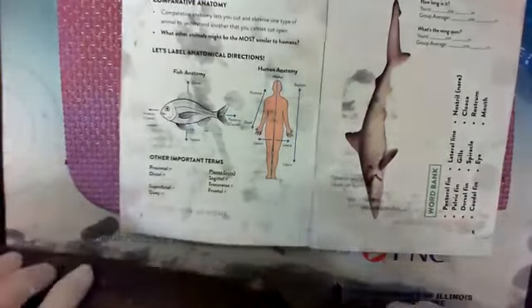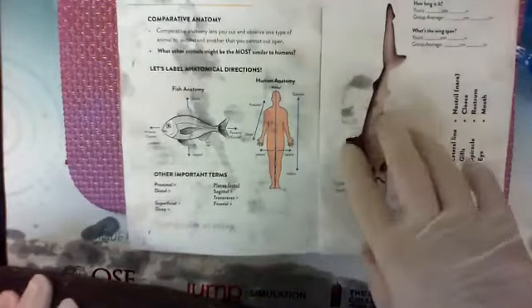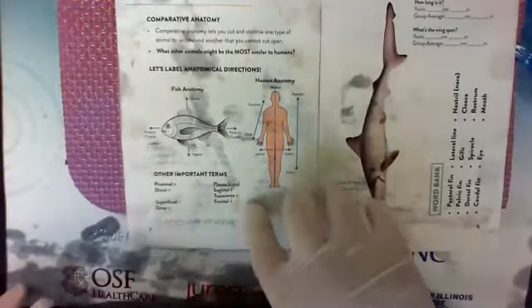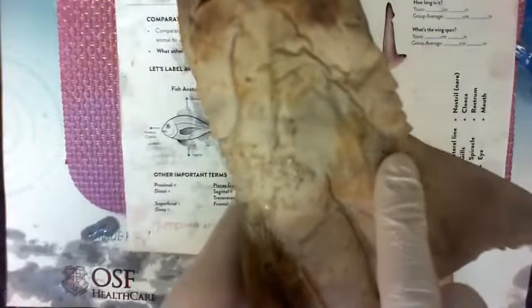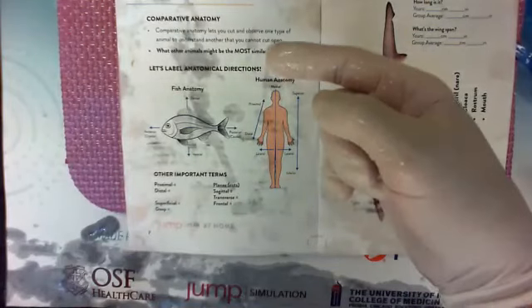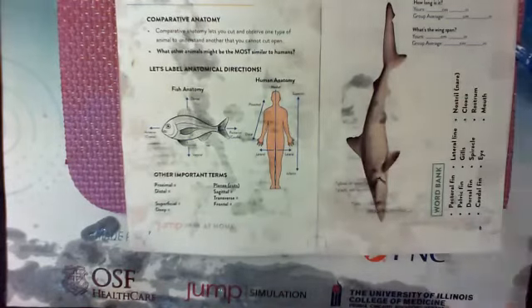Just comparing. And then these planes, a sagittal plane means you're cutting it right down the middle and separating left from right, which we'll do when we get into the belly. Where that folds at, we'll cut along that, and that's a sagittal cut. A transverse means across. Like you can see where these arrows go, those are in a transverse plane. So when we get into the chest, we'll actually make a transverse cut from this side across. Frontal means you're cutting the front off of something. So if I had something that would peel my face off, that would be a frontal cut. What a weird, morbid thing for me to pop into my mind. Crazy. But there it was.